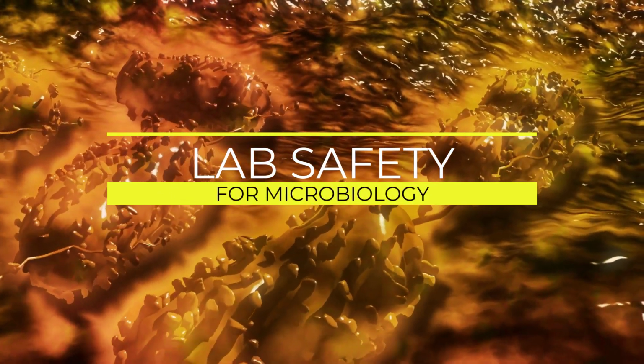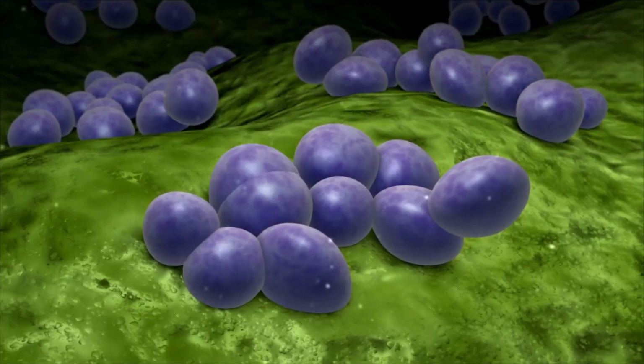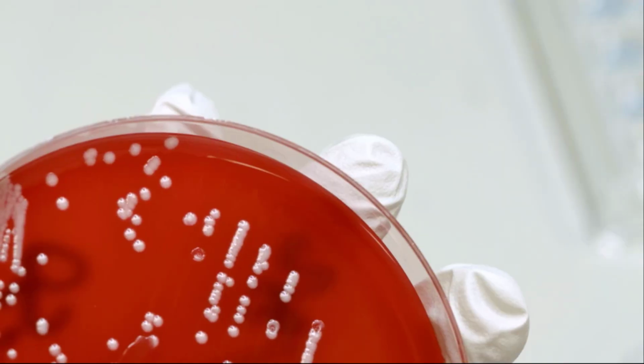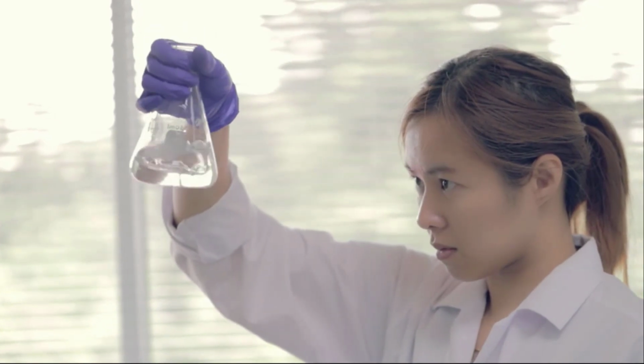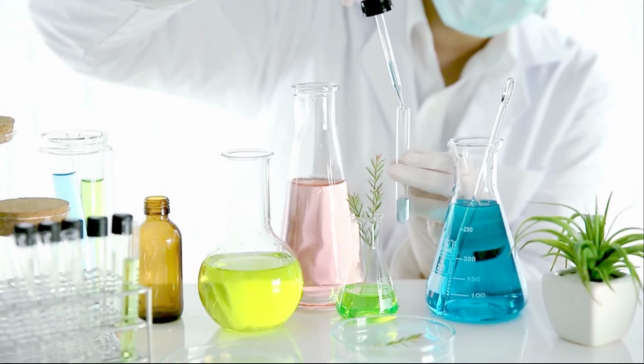Welcome to Microbiology. Some of the laboratory experiments included in this class may be hazardous if you handle materials improperly or carry out procedures incorrectly. Safety precautions are necessary when you work with any microorganism and with any chemicals, glass test tubes, and sharp instruments.